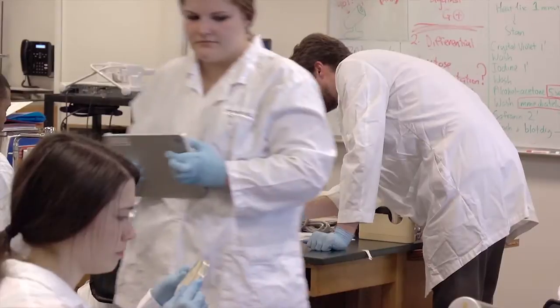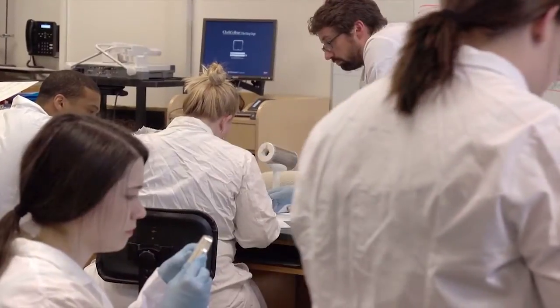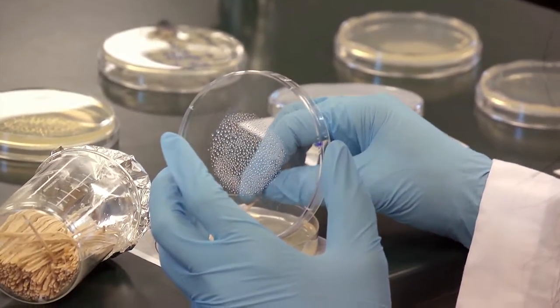And so up to, I think it's 50 to 70 percent of today's antibiotics actually come from soil microorganisms. And so what we have done is students harvest samples from all over Clark College. They screen them looking for life, which is very easy to find, and then we find the ones that are actually making these compounds.